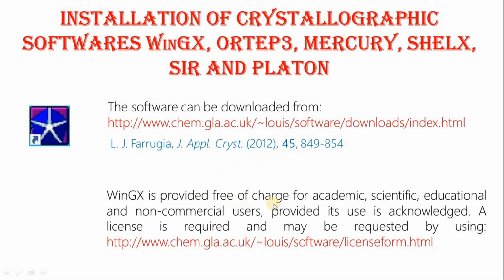WinGX is provided free of charge for academic, scientific, educational and non-commercial users, provided its use is acknowledged. A license is required and may be requested by using the following link.